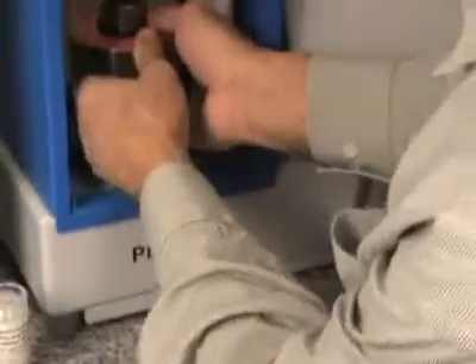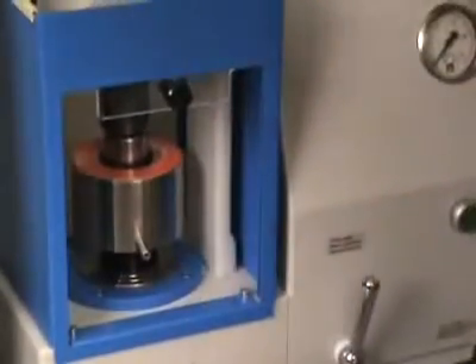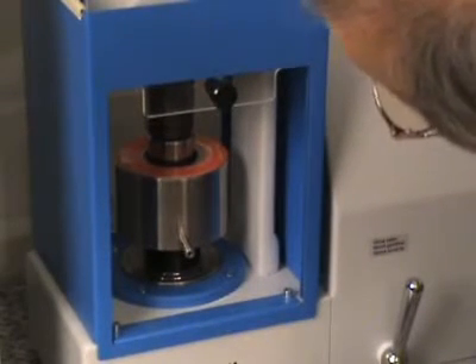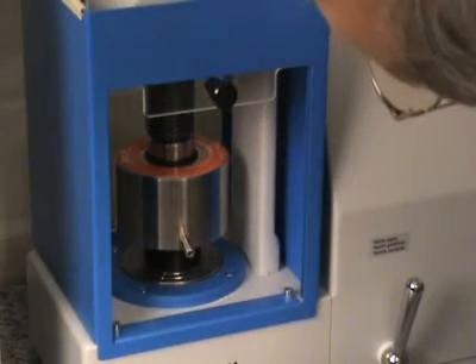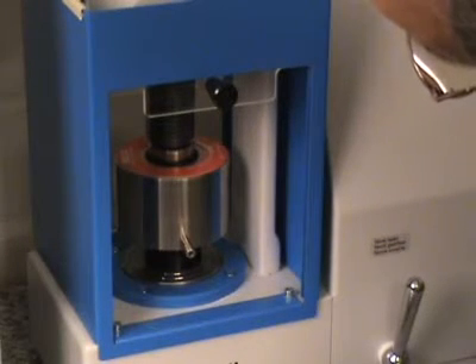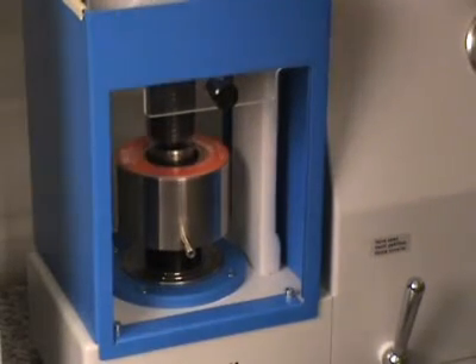The die set is now put under the press with the extraction cup below, and you carefully lower the piston by hand so that the pallet falls into the extraction cup.